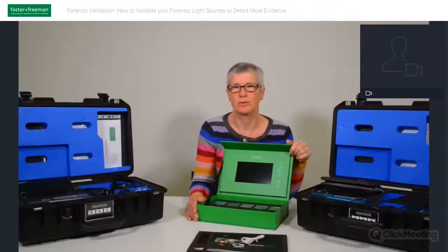But if you want to add further samples to the kit, we would recommend creating your own body fluid samples. The process can be very simple, and we're more than willing to provide guidance on how to get started. It's a subject that I'm personally very invested in, and something that I really do think laboratories should be doing.